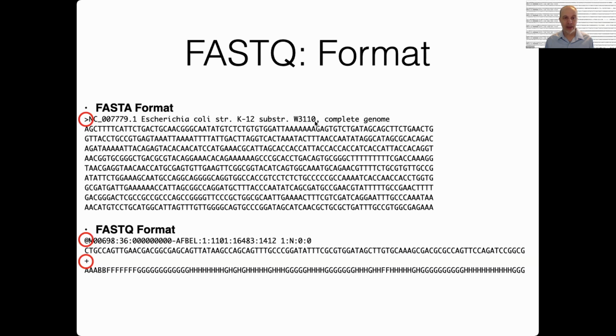The other thing that I will mention that people get confused about is that you can see here in the FASTA file, it's pretty common for the lines to be cut at 80 characters. And that's not a requirement. That is often done just so that it doesn't run off the edge of the page when you're viewing it. And it is also pretty common for FASTQ files not to cut the lines. So it's pretty common that you'll have the sequence line just keep on going. Like I said, this is 75 or 100 base pairs. You could have a 200 base pair sequence read, and it'll just keep on going to the right and not be cut.